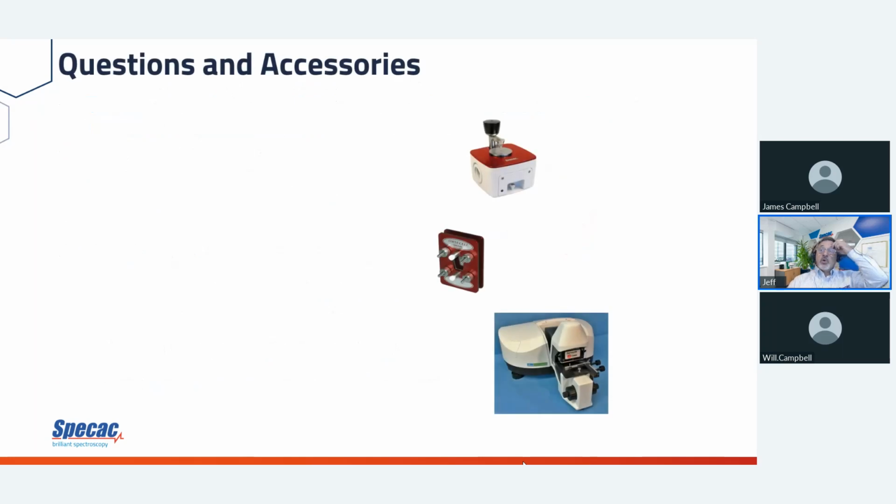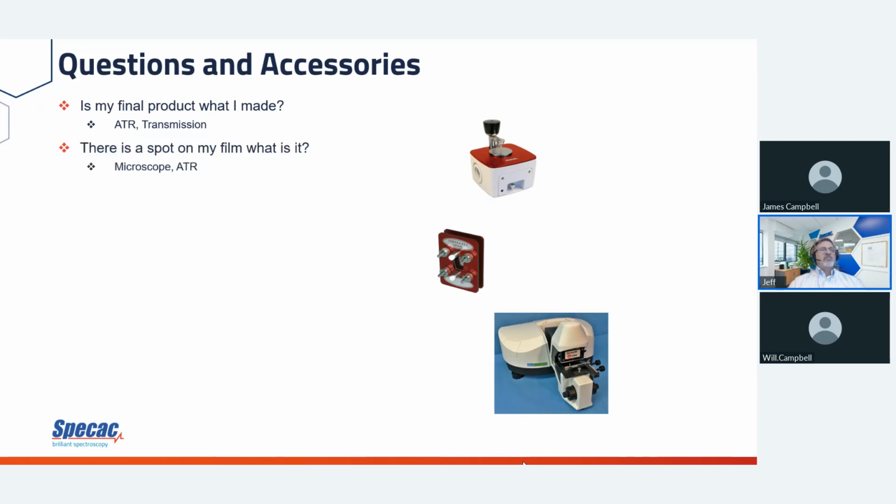So here are some questions, and the answers are the accessories. What's my final product made of? You can do that by ATR or transmission, very easily done. I've got this spot. I'm making this polymer film, and all of a sudden I've got this blemish on there, or this black particle in there. You can analyze it. If it's a blemish on the surface, an ATR can do that, whether you're using a regular ATR or one from a microscope, which the microscope in the picture in the lower right-hand corner does have an ATR on it.